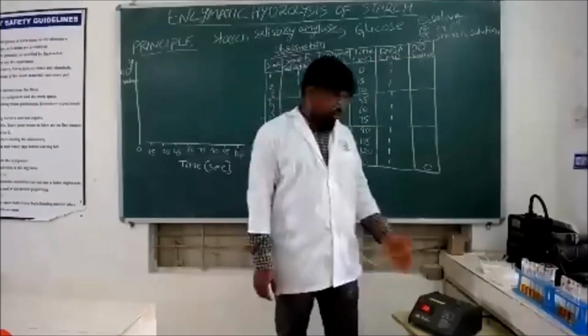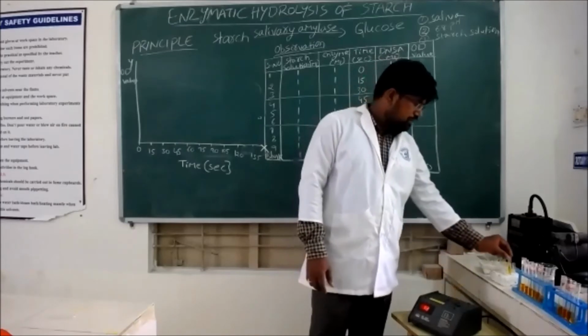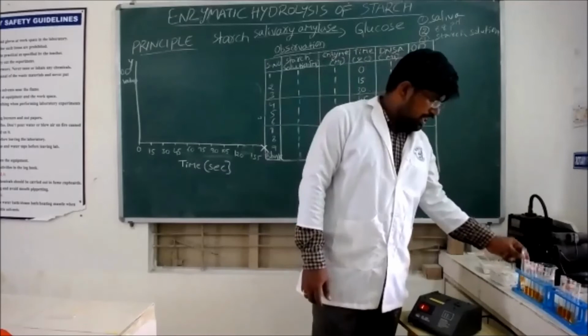Okay, now the instrument is auto zeroed with the blank. Take out the blank. Now one by one measure the absorbances.